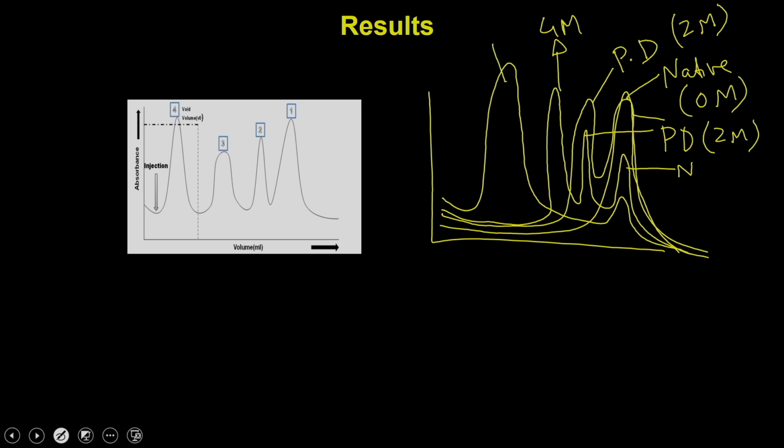Otherwise, all the protein is going to be converted into the denatured protein. So, if you can see this movement, you can conclude that the protein is showing you a denaturation curve, and that tells you the stability of the protein, because the relative proportion of these conformations in different peaks is going to give you an idea of how stable the protein is.